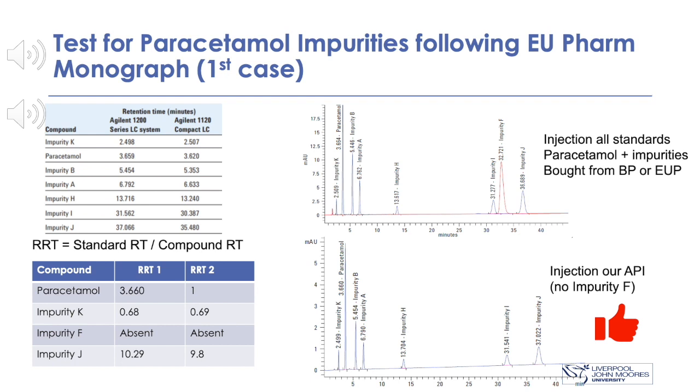Still, for both machines, the performance of the assay is valid within the limits of the European Pharmacopoeia. You should read the monograph, and it will explain at the beginning how you can make sure that your HPLC is fit for the analysis or not.